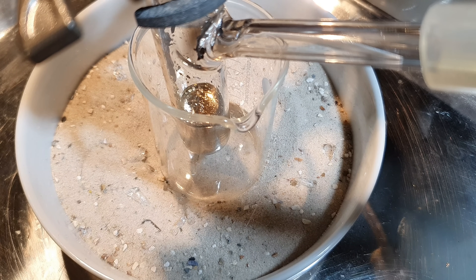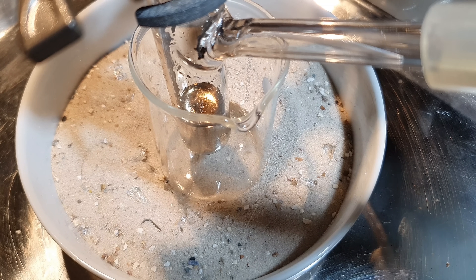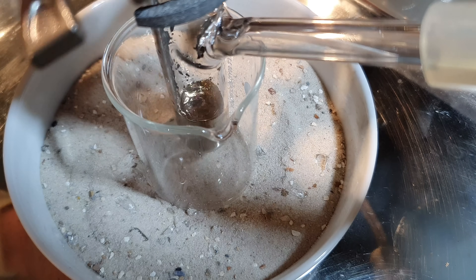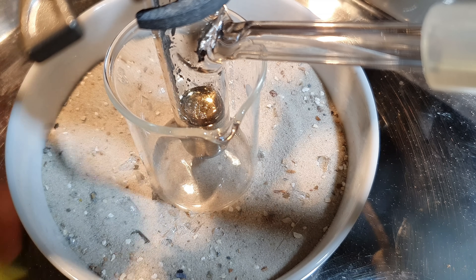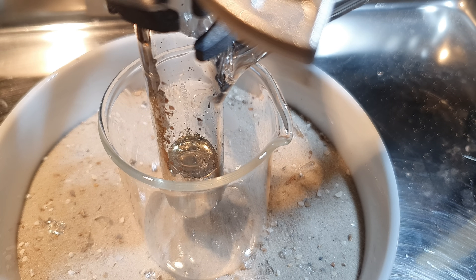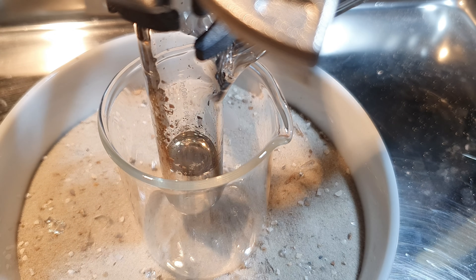Moment of truth. I have introduced a little bit of oxygen. Not much seems to happen. The temperature is still the same. I think I'm going to heat this up a little bit. Let's introduce some more oxygen. Again, not much of a change.